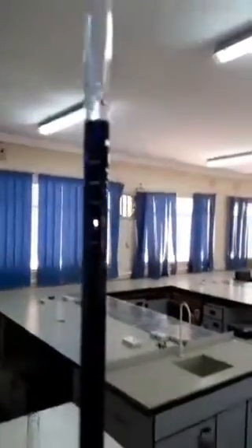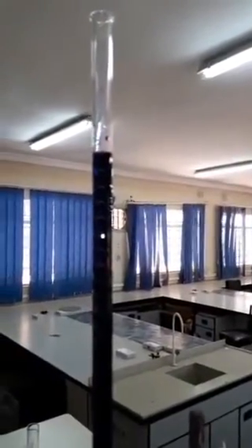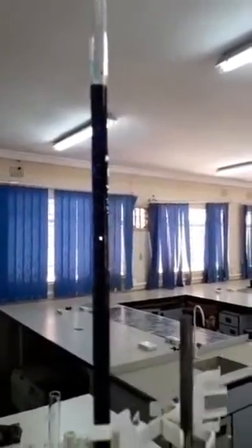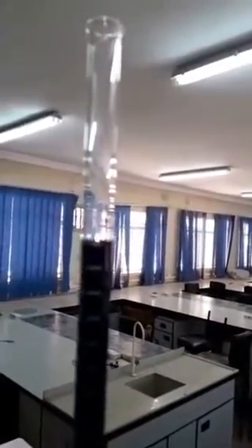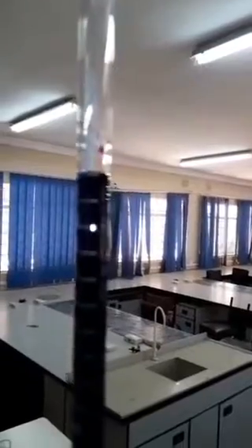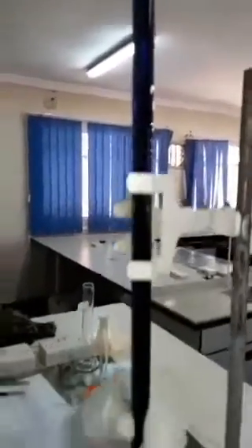It's at 0 mark. So it's at 0, and now I'll start the titration. And notice that when we're doing titrations involving potassium permanganate, we take the readings from the top of the meniscus, because it's difficult to see the lower meniscus of the solution because of the dense color that it has. So I've started titrating. Please look out for the color change.